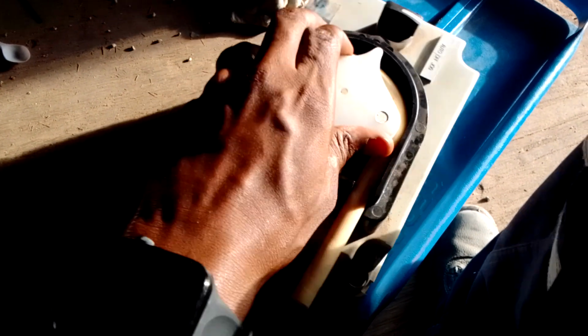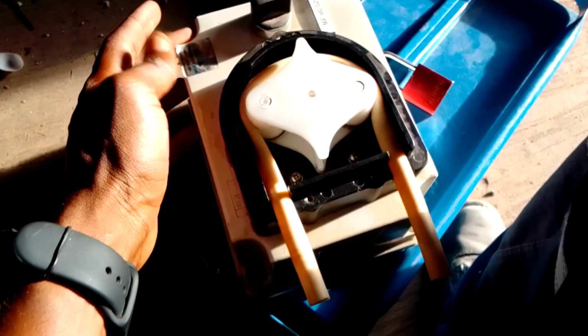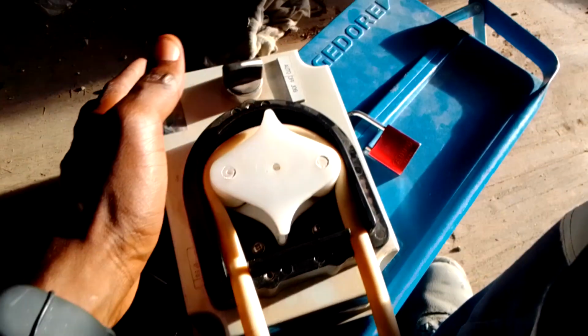Today we're going to be talking about this little device. It's called a peristaltic pump. So I hope you stay tuned for that.